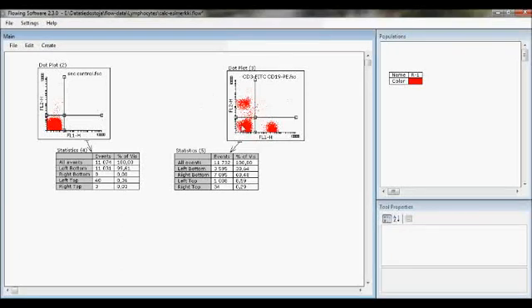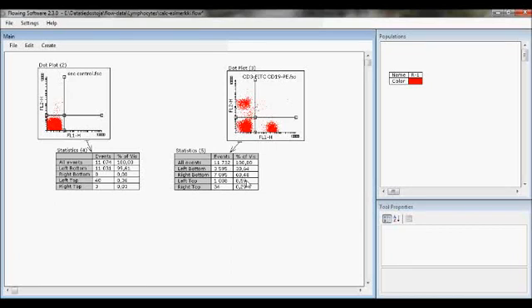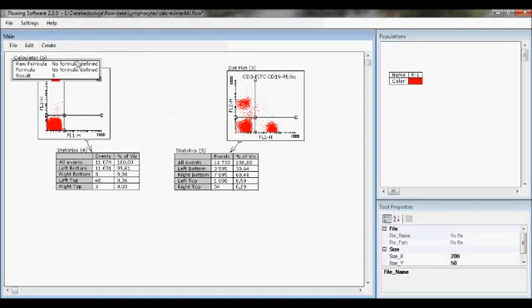I have staining here, CD3 versus CD19, and the percentage values here, and then the secondary control having some unspecific binding in the FL2 channel. I would like to subtract this number from this to get the real value for CD19 positive cells. And in statistical tools I can find a calculator.